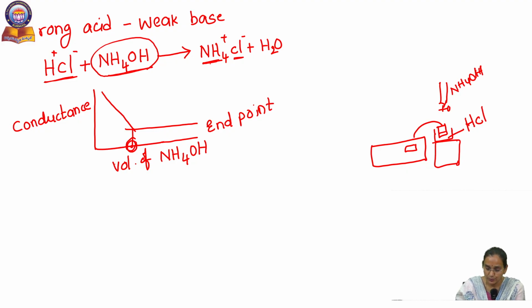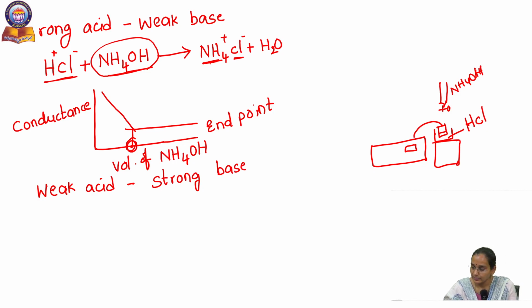Next, coming to weak acid versus strong base. Same setup, but we have to change the acid and base.